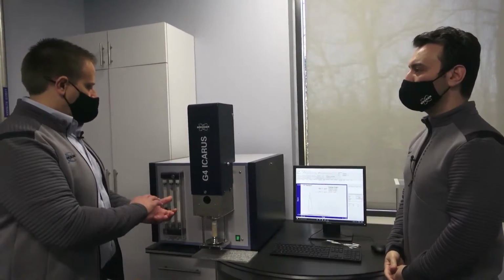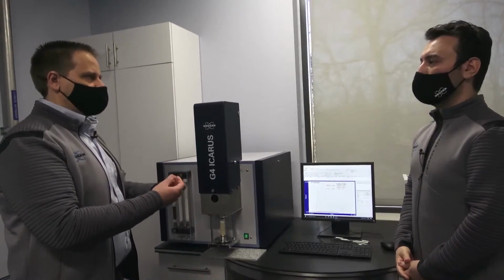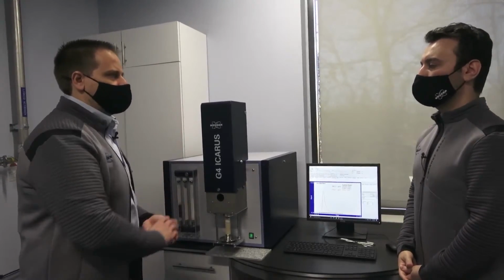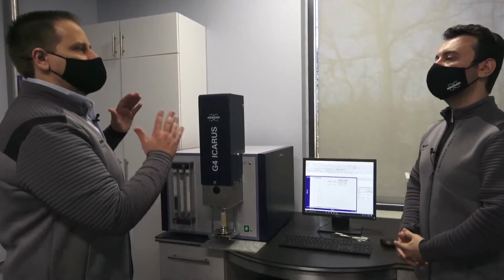Okay, so if I'm in a foundry and we have a machining operation, I could actually take some of those shavings, clean them thoroughly, and use those directly. Yeah, correct. Okay, great. So now this was combustion gas analysis, carbon, sulfur.